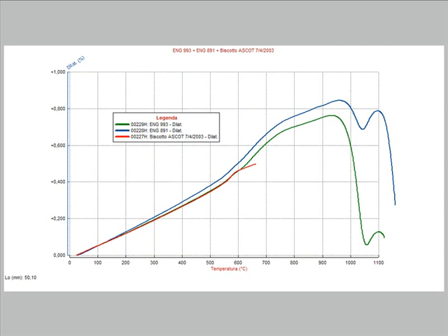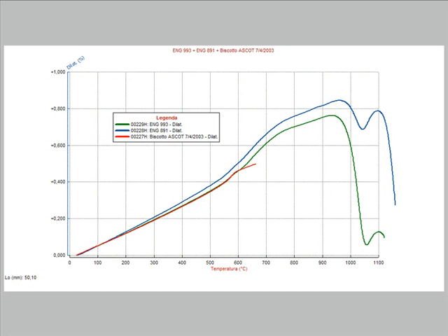This is the result of the measurement on a ceramic body in red, overlapped with different glazes. The editing software enables any kind of graphing elaboration to make comparison between the results obtained on different materials and obtained with all the instruments of the misura family, like softening, melting, sintering, flexion, and so on.